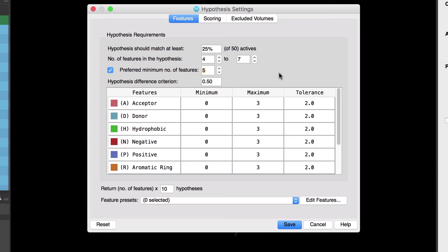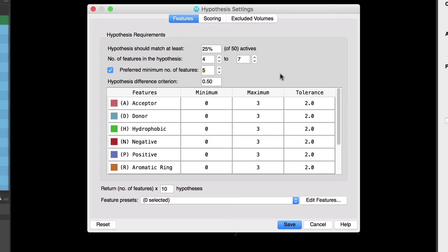So in this case the pharmacophore perception will start by looking for a seven point hypothesis. If it can't find any it'll look for a six point hypothesis. Again if it can't find any it'll move down looking for a five point hypothesis and so on. And since we set the preferred minimum number of features to five it will keep searching for hypotheses even if it found some seven or six point hypotheses.